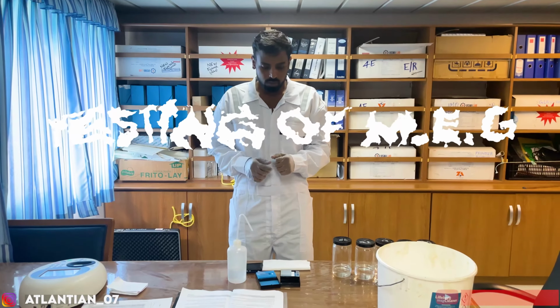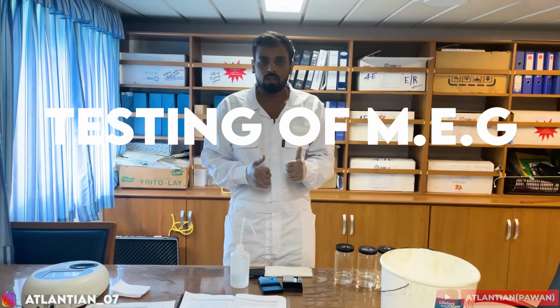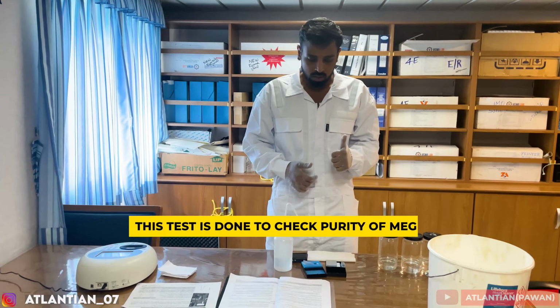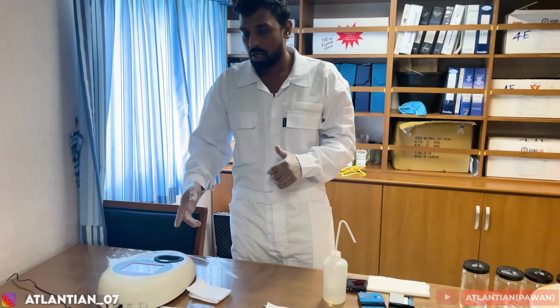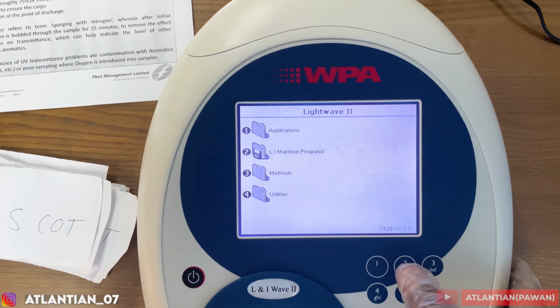So hello guys, welcome. Today we'll see how to do testing of M.E.G from UV transmission point of view in spectrometer. So this is my spectrometer. I'll switch it on. Let me give you a close look. Once this is on, this is the main menu which will appear.